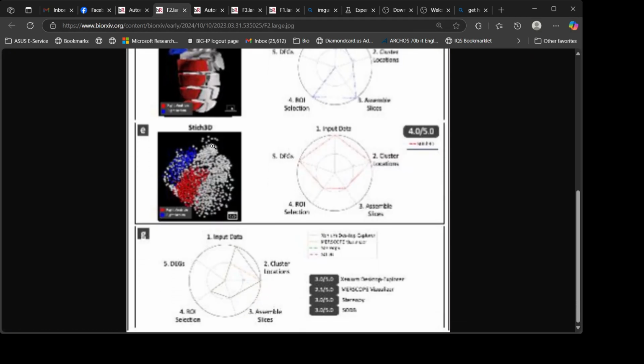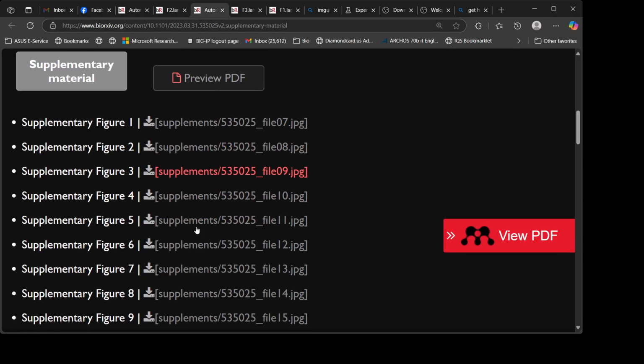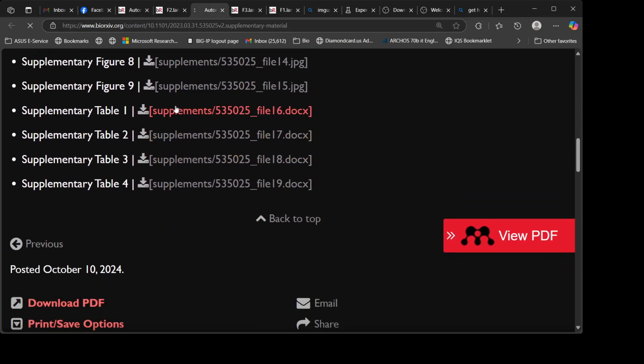Understanding molecular signatures of pediatric cardiac rhabdomyomas using VR-Omics. To further illustrate VR-Omics' unique end-to-end capabilities in the analysis of multi-slice datasets, we tested it on an original co-planar dataset to interrogate a disease mechanism that has not previously been transcriptomically investigated.